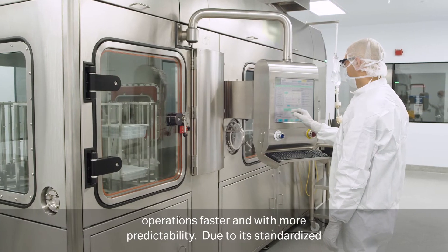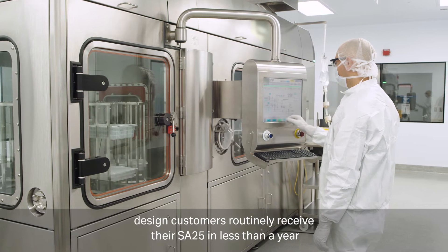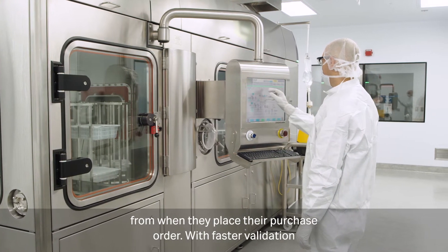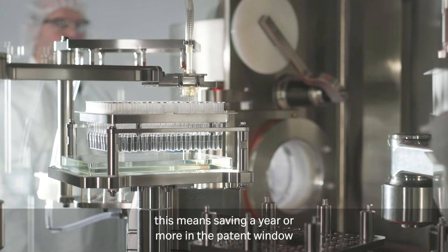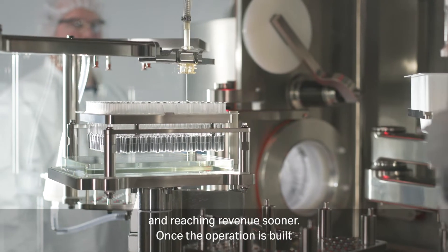Due to its standardized design, customers routinely receive their SA25 in less than a year from when they place their purchase order. With faster validation, this means saving a year or more in the patent window and reaching revenue sooner.